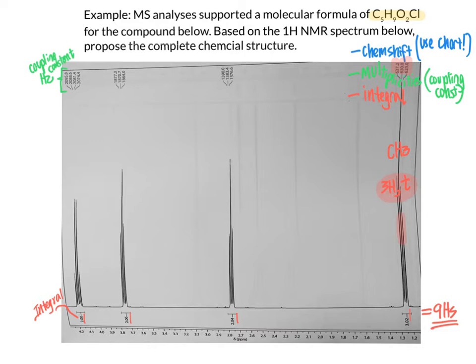And in order for a methyl group to show up as a nice clean triplet like this, that means that methyl group needs to have 2 vicinal hydrogens, which I'm going to plug in just as CH2. And the fact that this is a nice, very distinct, very even triplet, with a signal here and here that are relatively symmetrical, flanking it with the expected 1 to 2 to 1 ratio, giving a nice, perfect looking triplet, we expect that that CH3 is directly bonded to a CH2 group. So our CH2 group is right here. So we have our CH3 directly bonded to a CH2 group is what we're hypothesizing is going on here.